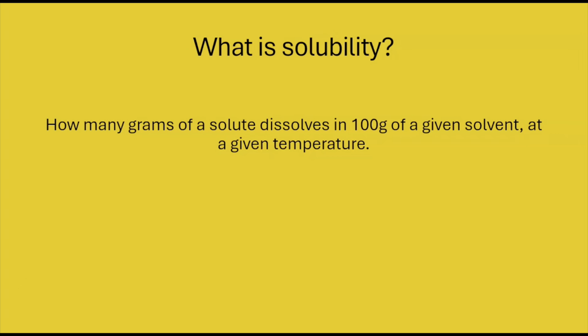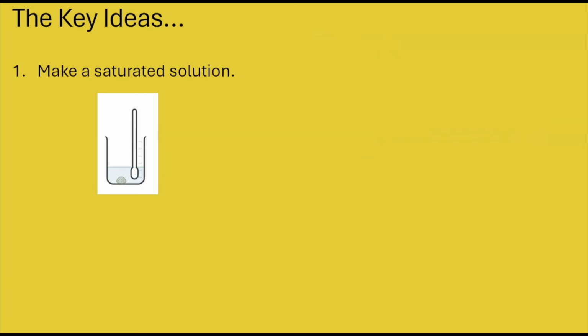And it also is at a given temperature, because we know as temperature increases, the solubility of a solid solute also increases. So we must make sure, if we're doing any sort of experiment, that we are only changing one variable, and we're not changing temperature in this core practical here.